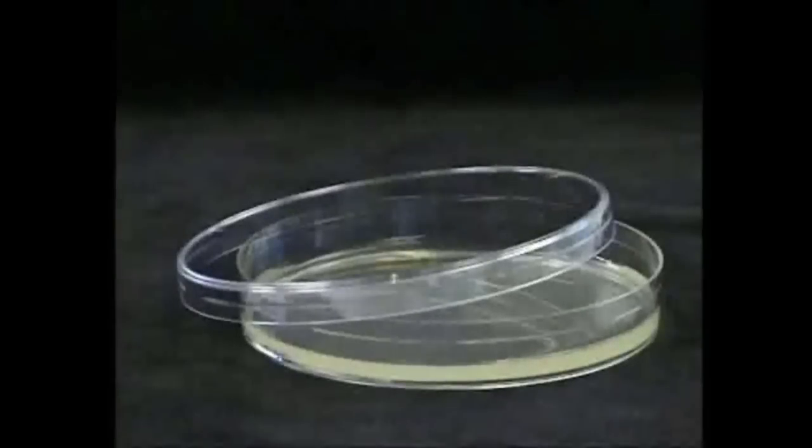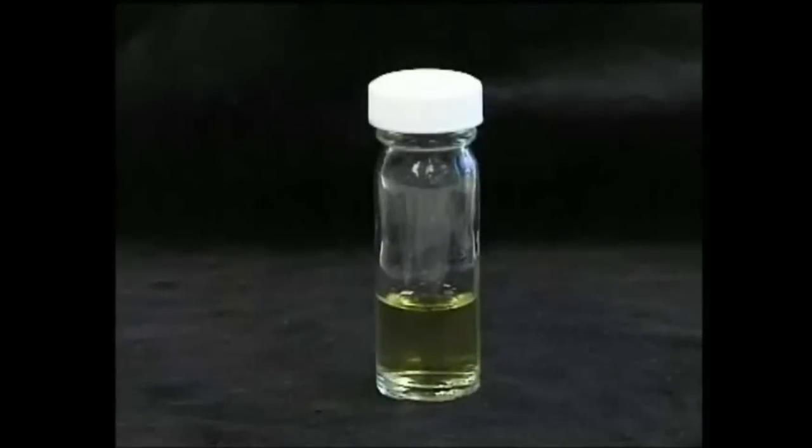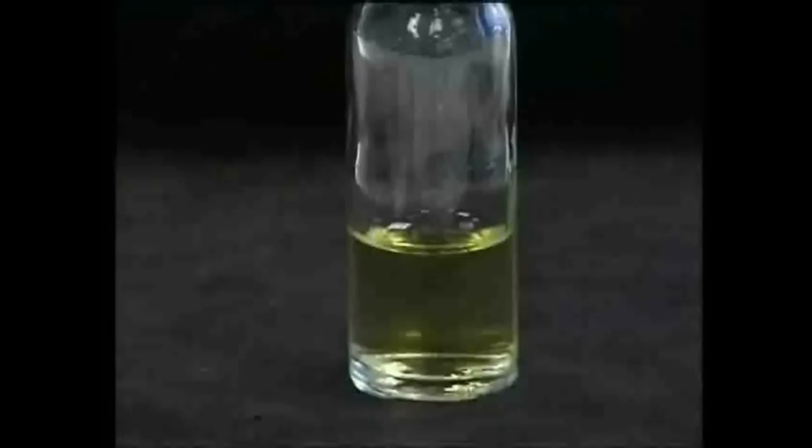The substance used for the growth of bacteria and fungi in the lab is known as the medium. Media can be either solid or liquid. A liquid medium is known as a broth. There's no nutritional difference between solid and liquid media. Both contain all the necessary requirements for microbial growth.